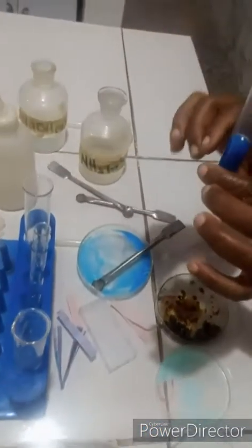The essence is we want to see whether the precipitate will dissolve or not. Shake it properly and check whether the precipitate will dissolve or not. You can see that the precipitate is insoluble. If a precipitate dissolves, it's going to give you a clear solution. But once the solution is cloudy, you can see that the precipitate is settling down at the bottom. So your inference is ppt is insoluble. And our inference is copper 2 plus is confirmed.